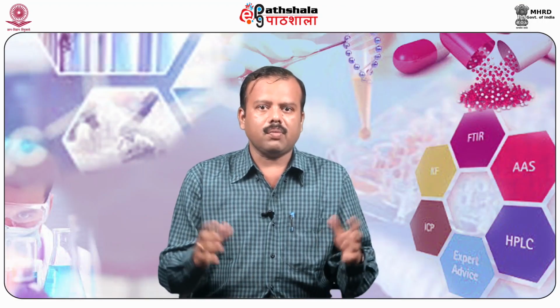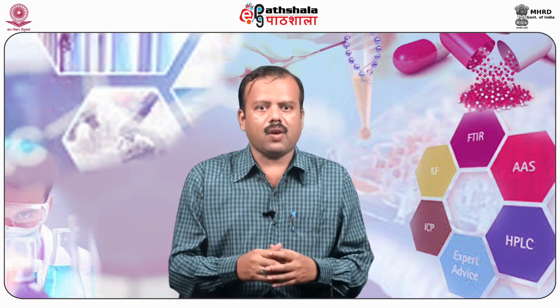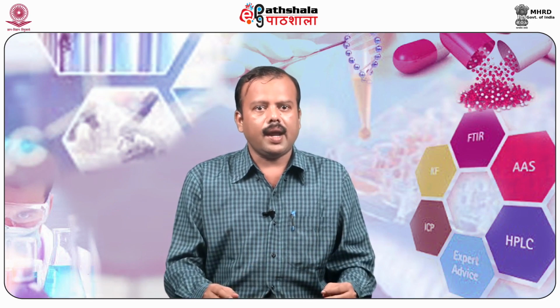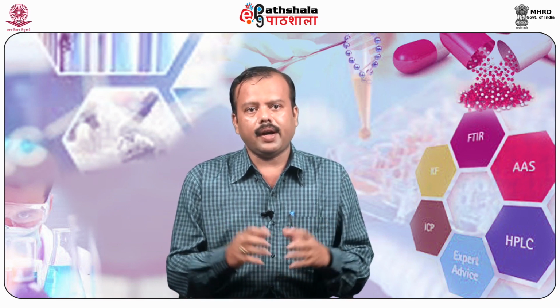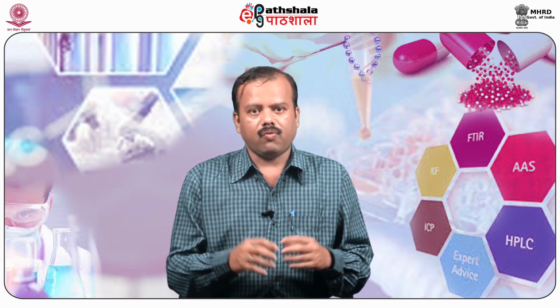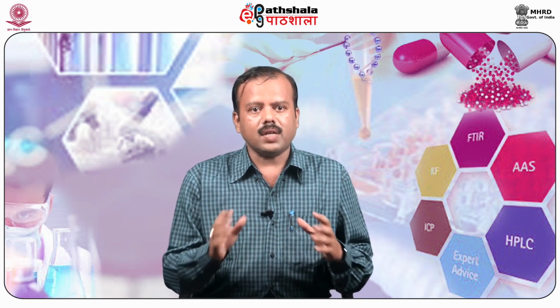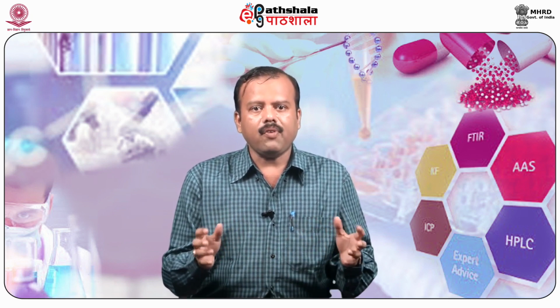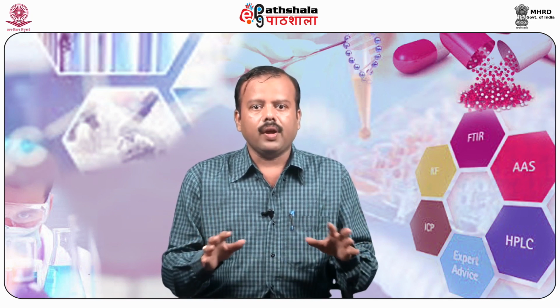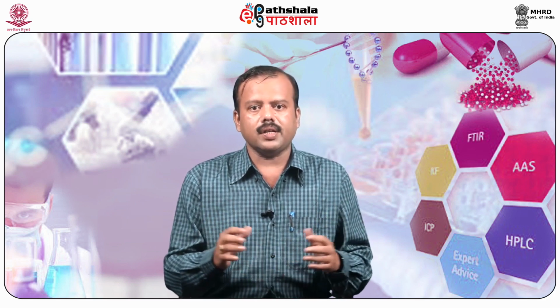So students, let us summarize what we have learnt in this module. Specified strains of Staphylococcus aureus, Pseudomonas aeruginosa, Proteus vulgaris and E. coli are usually recommended and obtained from specified culture banks like ATCC for the assay process. Genetic stability of the microorganisms must be controlled in order to prevent the development of a resistant strain. The number of microbes in the inoculum must be uniform under different test conditions.